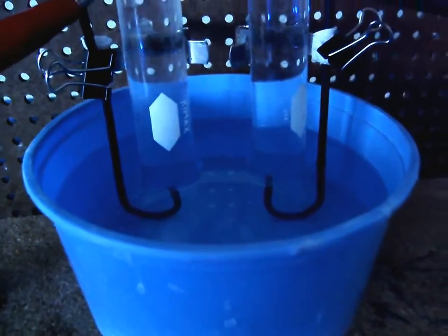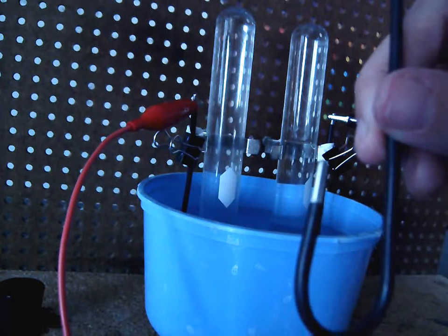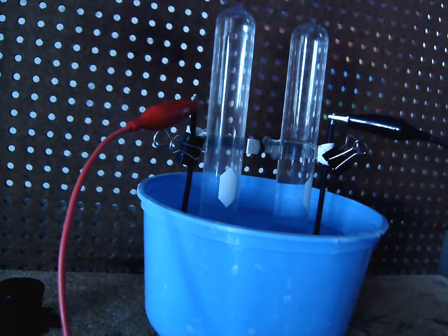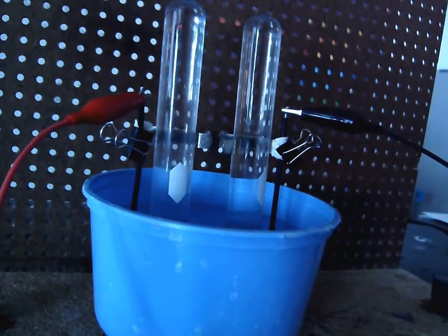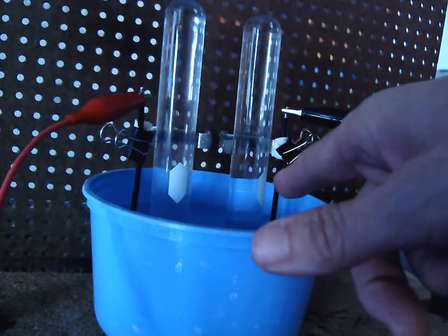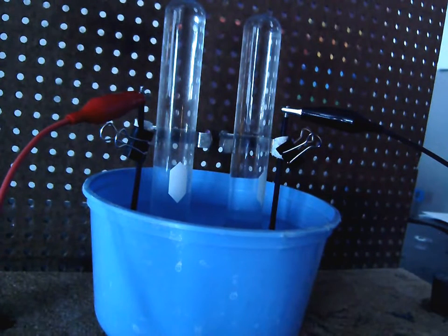So the tip of the electrode, which looks like I showed you guys a minute ago, looks like this. So that positive charge is going to run through and come out right here at the end of that electrode. Then the black one's running a negative charge, and so the end of its electrode will be generating a negative charge. And so what's going to happen is, between the two, the circuit will be closed from the battery through the cords into the electrodes through the water. And that's basically the circuit where the electricity will be passing through. Keeping in mind it is a low voltage amount of electricity, so it's not harmful to anyone.